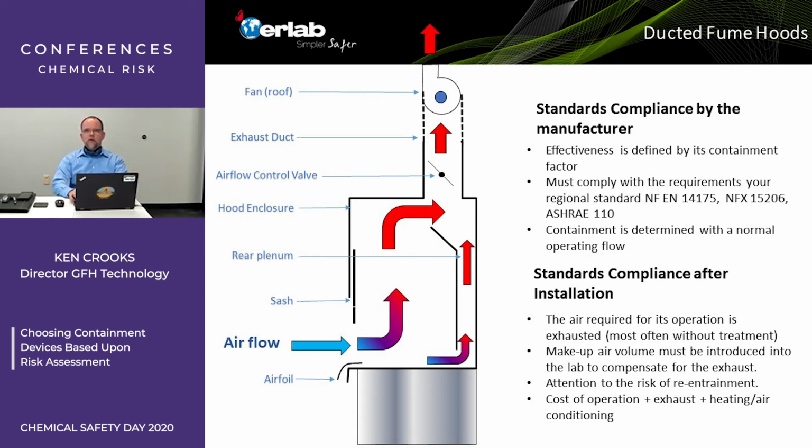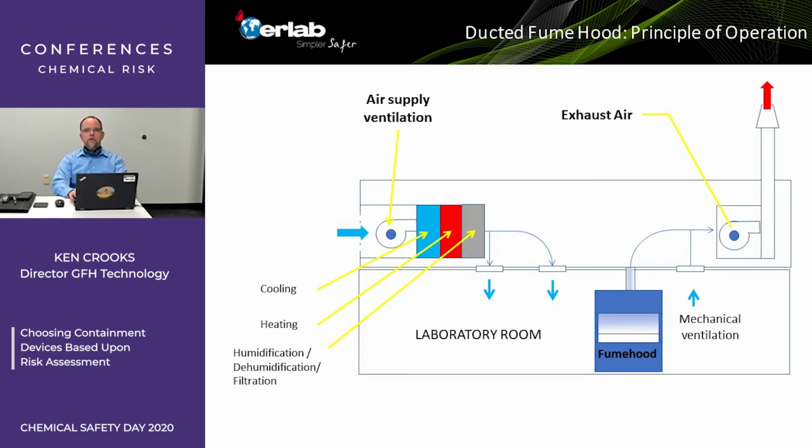And the cost of operation of that ducted fume hood is that exhaust air, plus more importantly, quite frankly, the heating and air conditioning of the makeup air. That's where the big operating cost comes into play. But there are times when you absolutely must exhaust it. It must be a ducted hood. We understand that. Here, from a laboratory to a building view, this is what's going on.